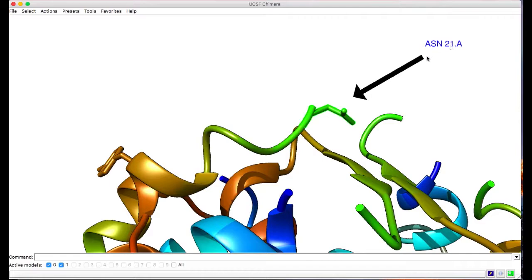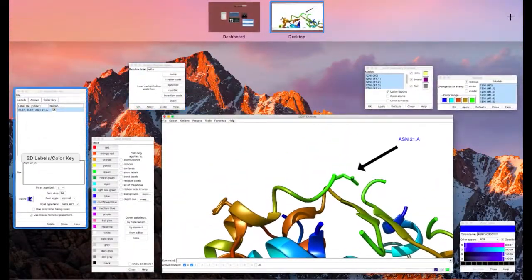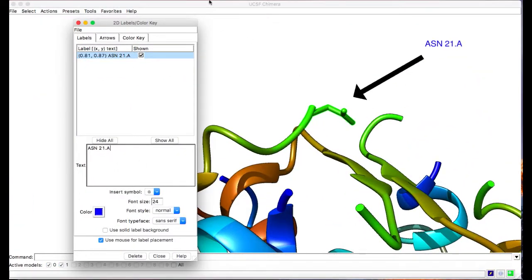Let's say you have this label. It's a super far, super clogged up region. You can point to it through these methods. Very useful. Allows you a little bit more flexibility, but a little bit more knowledge is needed to do it. You can also change the writing type. Now, there's not an extreme amount of fonts right here, barely 3, and you can change the bolds, but it can be useful for some situations.